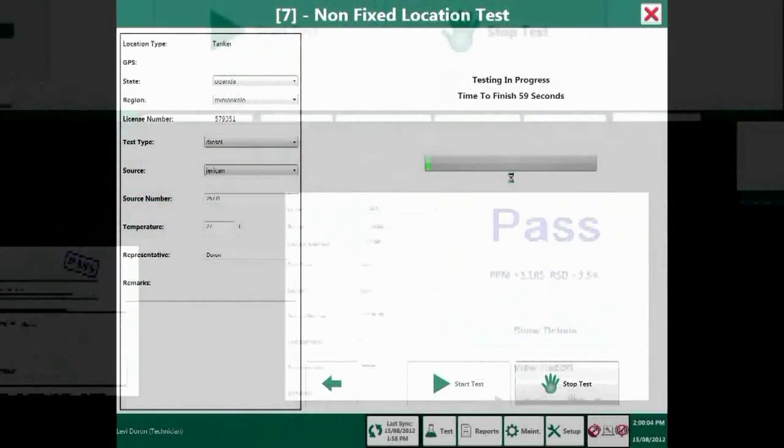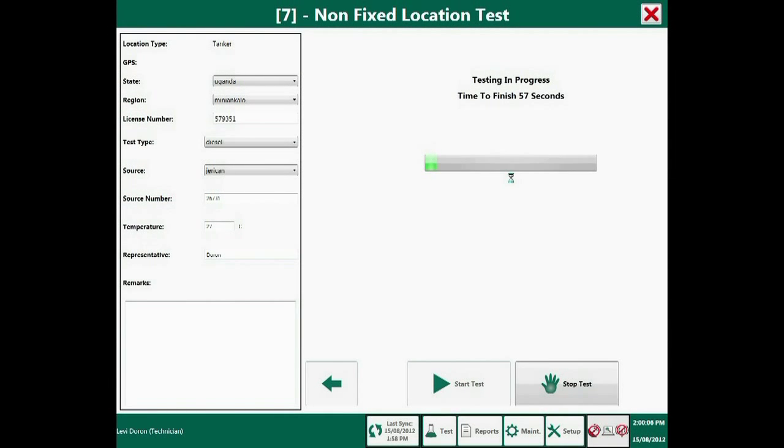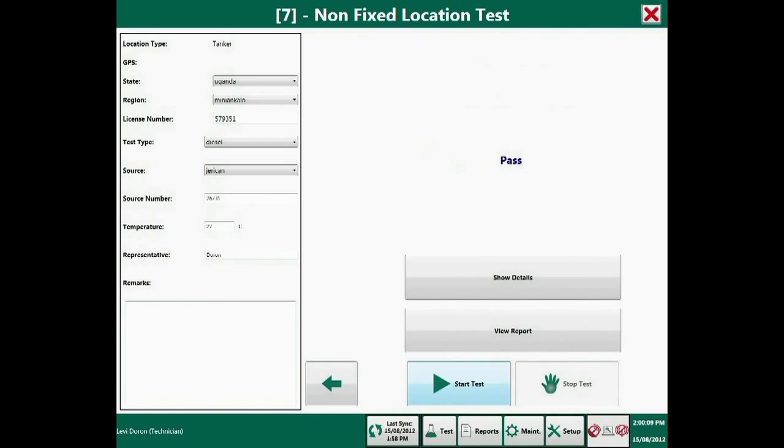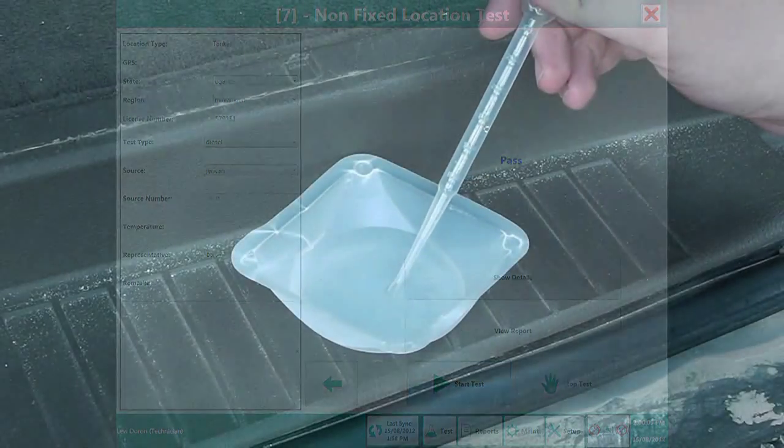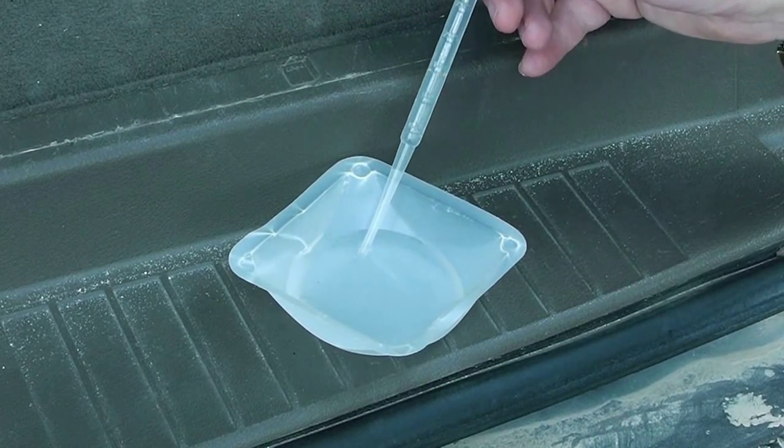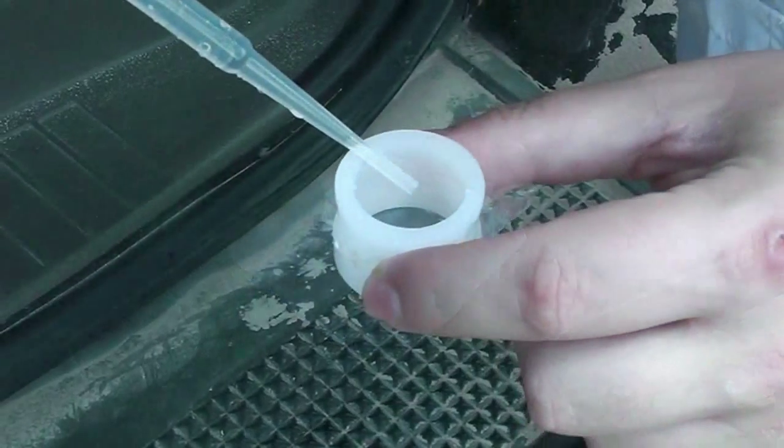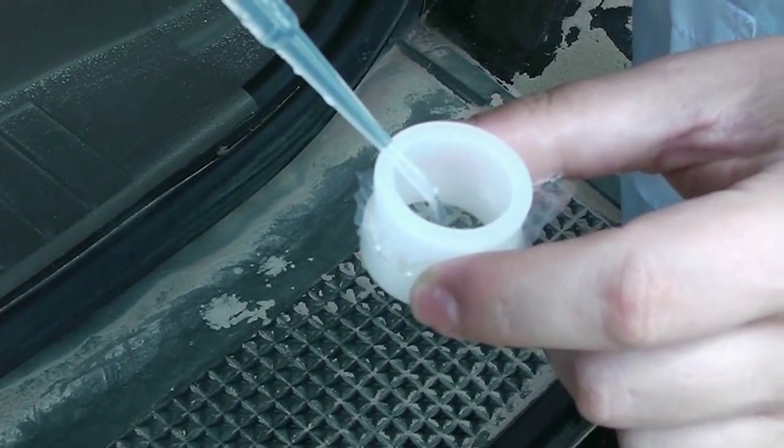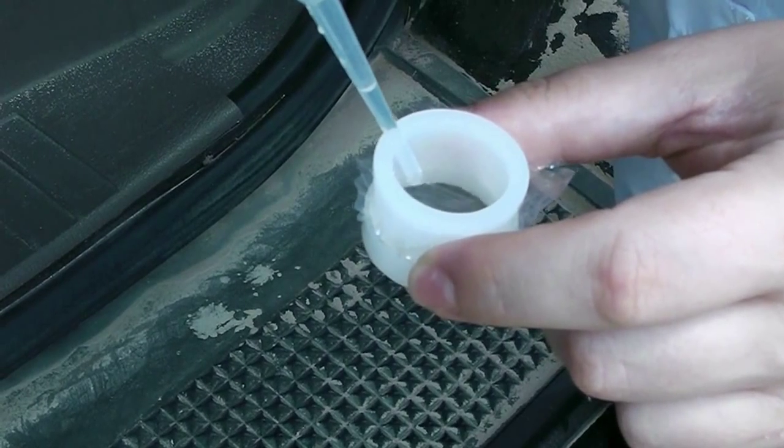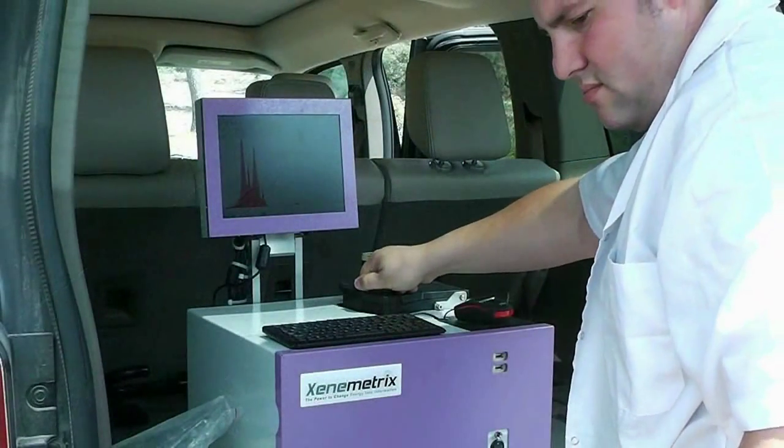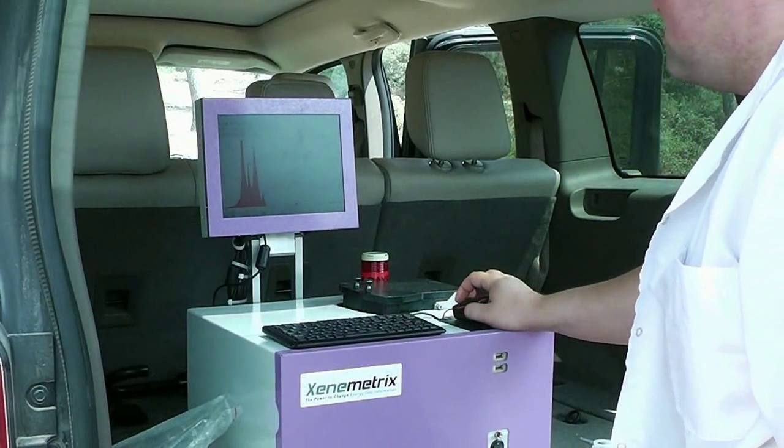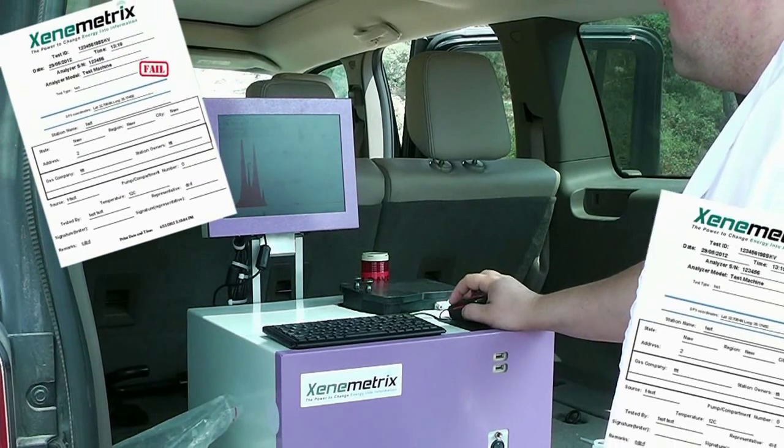The Easy Next performs as a pass-fail system for both qualitative and quantitative elemental analysis. It is best to use the Easy Next for quality control and quality assurance activities, as well as for mining and exploration activities. Easy Next can also be used for regulation enforcement with its built-in reporting and documentation system.